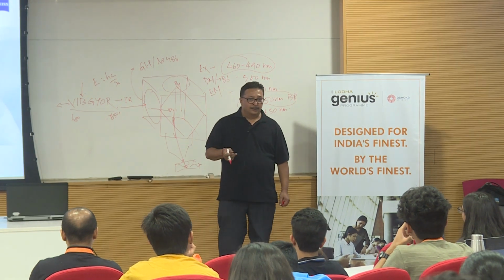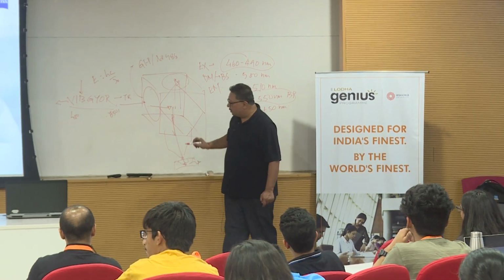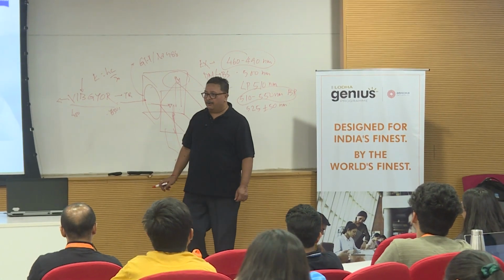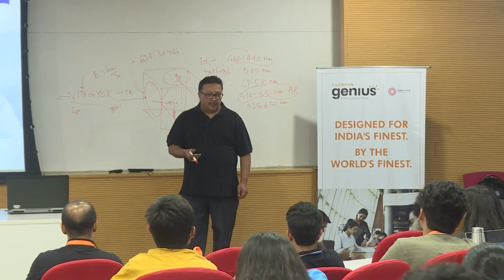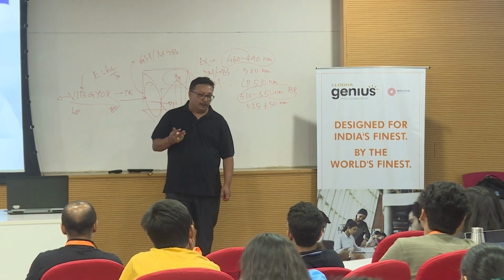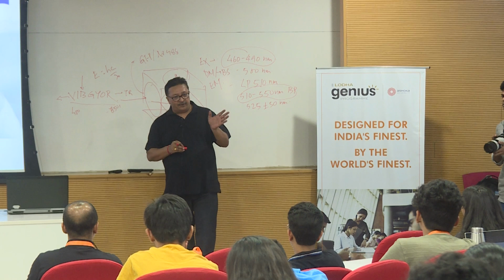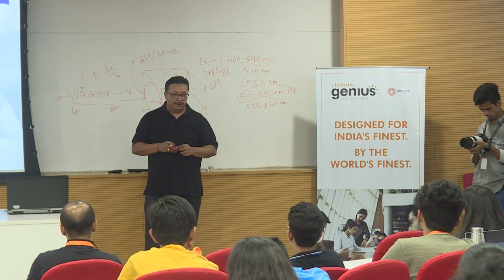So the concept here is very simple. You excite. So now excitation is blue, emission collected is green. If you have a DAPI filter, anybody have seen or known about DAPI? Nuclear staining. Excitation is violet, emission is blue. If you have a Cy3 fluorophore or a protein or an organic dye, excitation is with a green color, emission is with a red color.